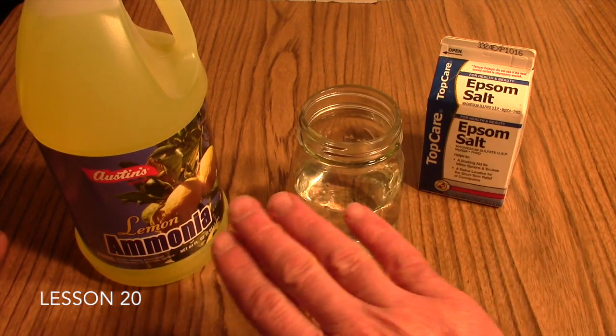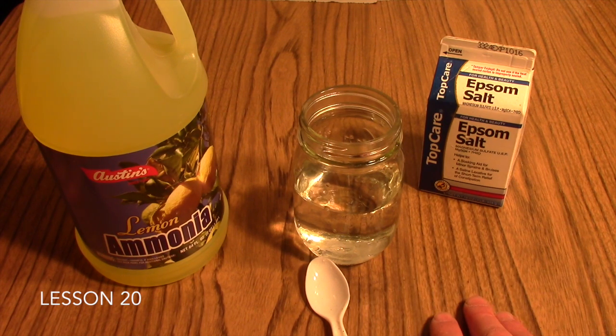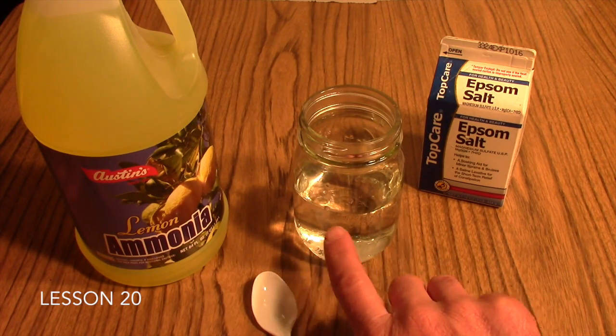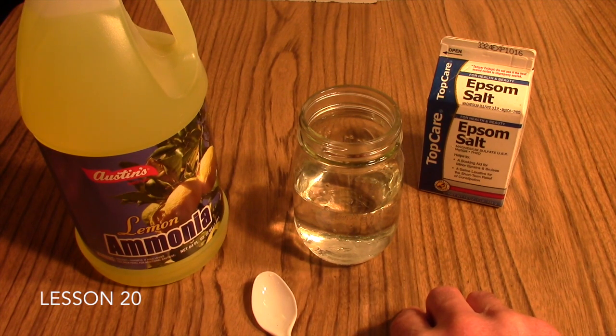Once they add the ammonia, you'll not want to stir it any longer — just let it set. After about five minutes, your students should start to see some cloudiness in the water, and that's the indication that the chemical reaction is taking place.